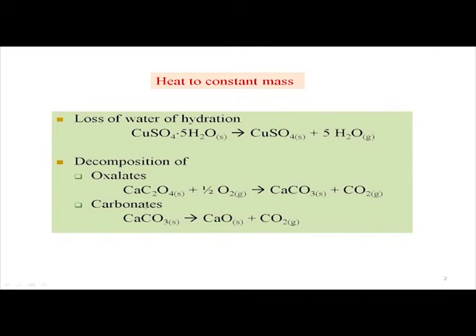So, once this calcium carbonate is formed, because in the clinkering process that we know for making cement samples, several carbonates or oxalates and all these things are heated together in the furnace, and we get a very complex structure of these oxides or hydroxides, which can be hydrated or dehydrated in a cyclic manner for all the cement samples. And we all know that this calcium carbonate and all these things are also very useful for their setting properties.